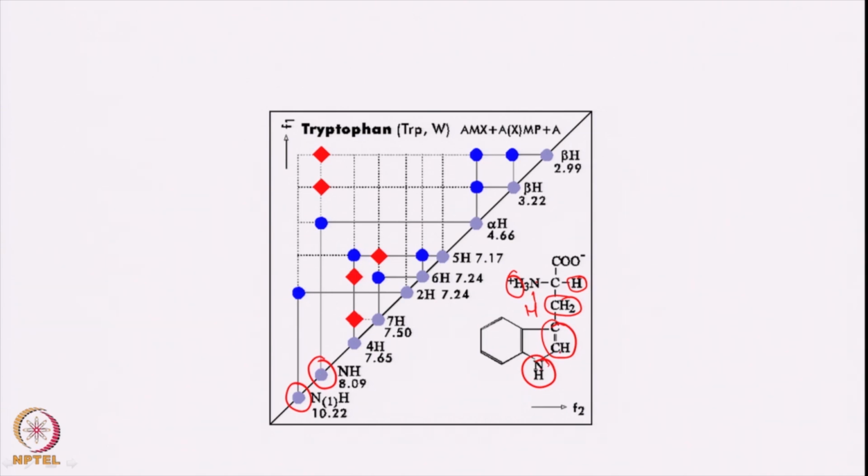Now, from this NH we can get the side chains. So, like here, so that is here. Now, from these aromatics you can again get all the aromatic correlations. So, here you have these aromatic correlations and you can assign them from these.